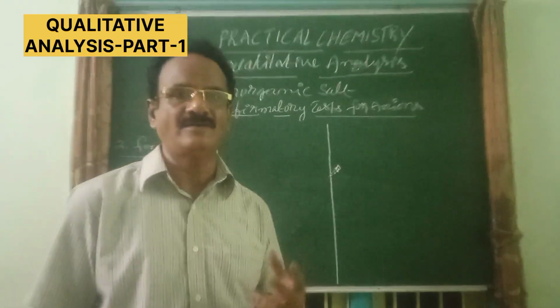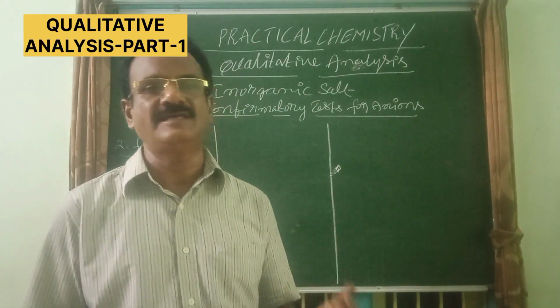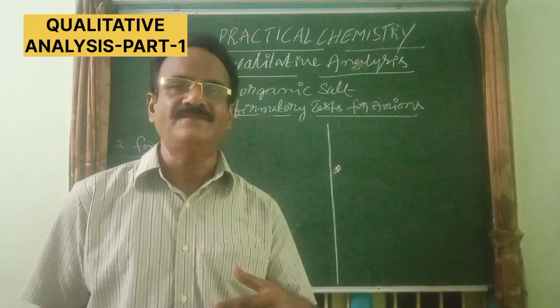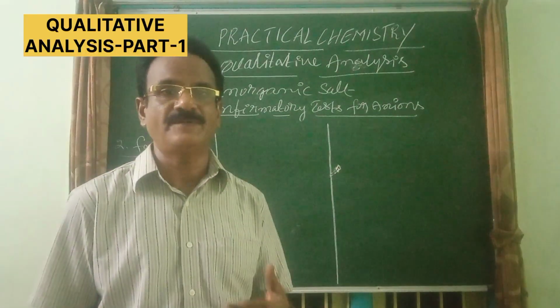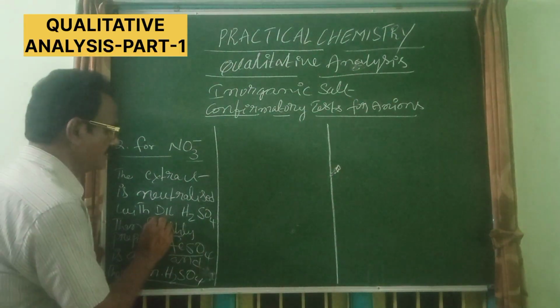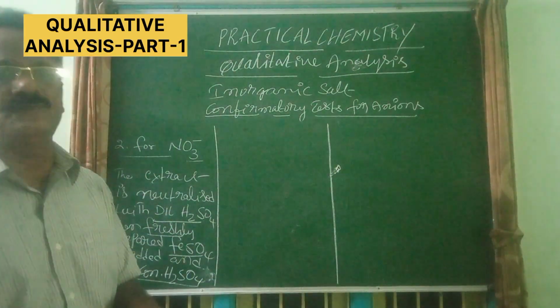If kept for a long time, it converts into ferric sulfate. To avoid that, the ferrous sulfate solution is to be prepared at the time of testing. Then concentrated H2SO4; keep in mind the conditions are important. For neutralization, dilute H2SO4 is used. For the test, concentrated H2SO4 is used.